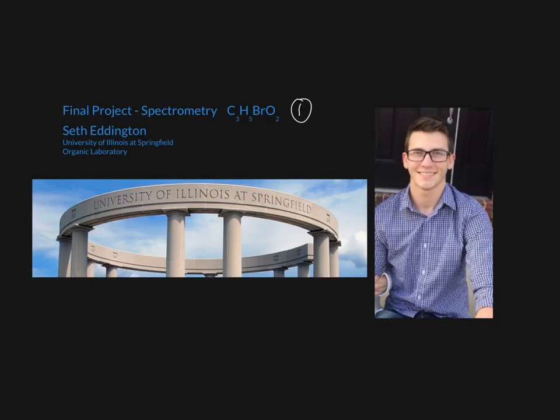I'm from the University of Illinois at Springfield, and this is my final project for Organic Laboratory for infrared, carbon-13 NMR, proton NMR, and mass spectrometry.